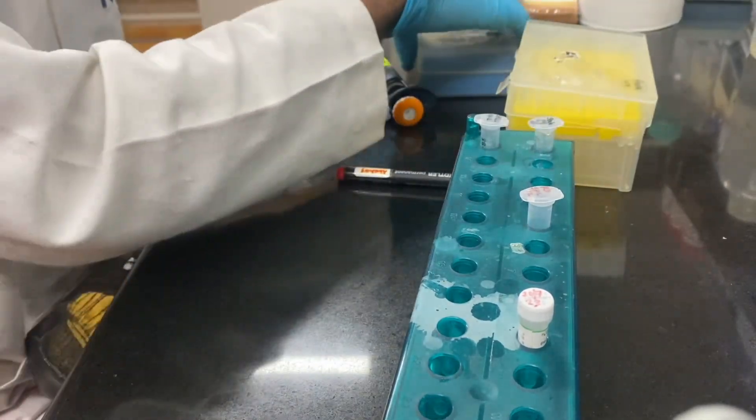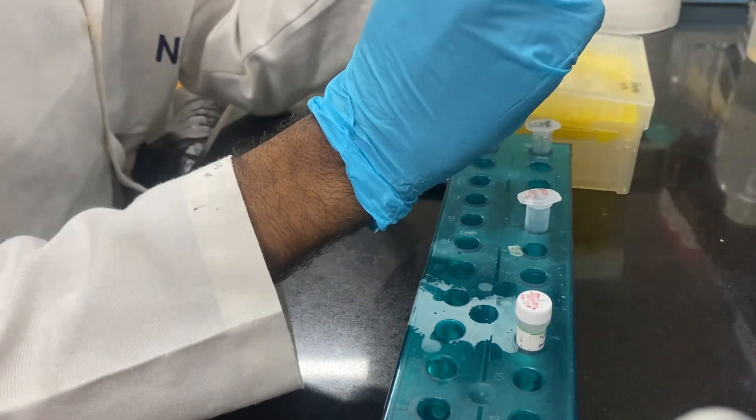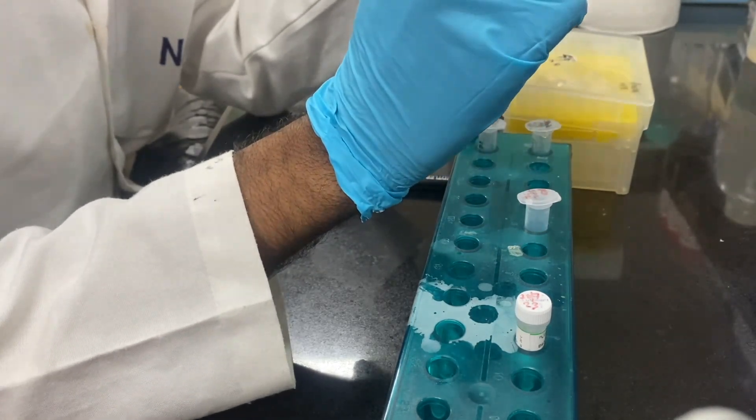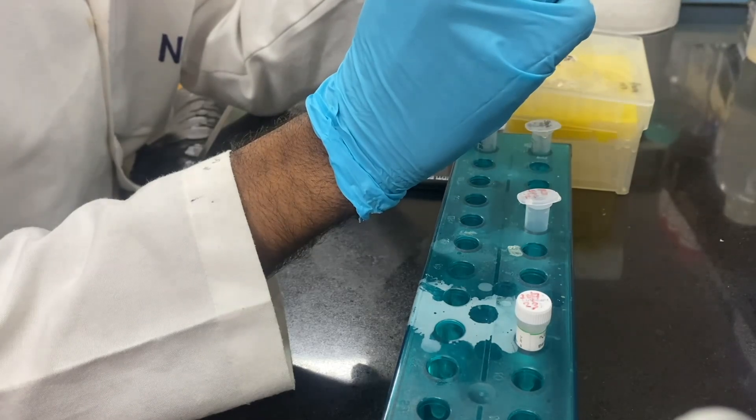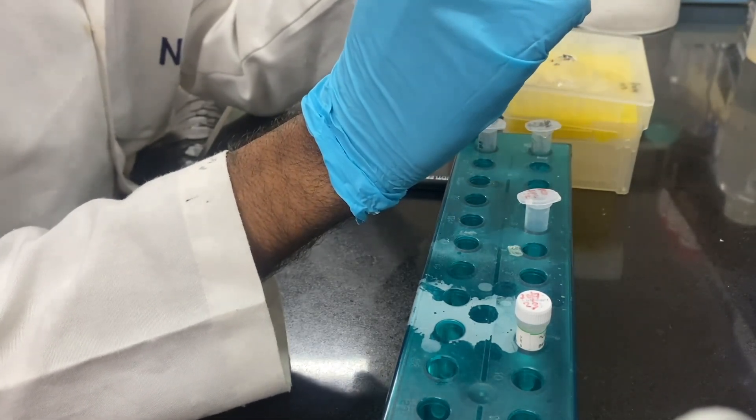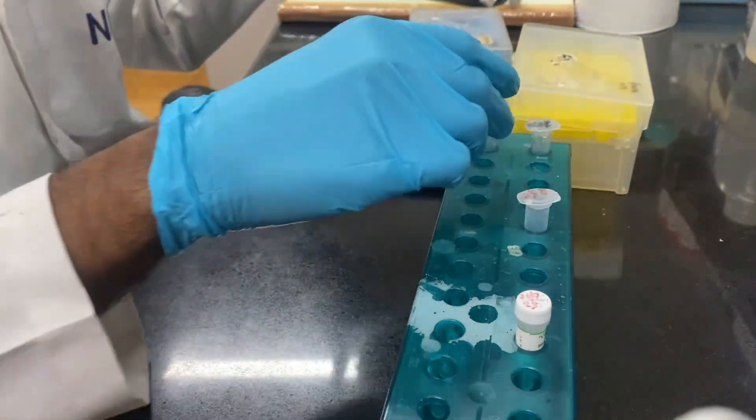Now we will add our plasmid DNA. The concentration of my plasmid DNA is around 188 nanogram per microliter. So for digesting one microgram I need around 5.4 microliter of plasmid DNA. We will add 5.4 microliter of plasmid DNA.